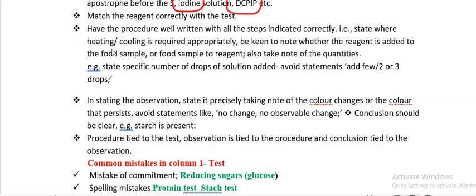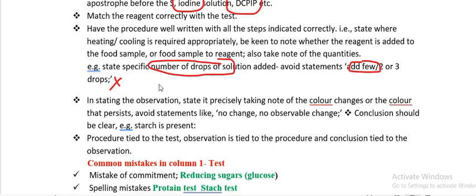When testing for starch, put the food solution in the test tube first, then add iodine solution. For vitamin C, it is the opposite — put DCPIP in the test tube first, then add your food solution. When noting quantities, state a specific number of drops. Avoid statements like 'add a few' or 'add 2 to 3 drops' — that is wrong, as it suggests you did not do the practical.